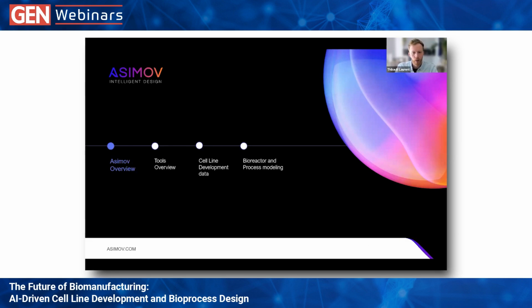As part of this webinar, I will briefly explain our mission at Asimov. We will go through the tools and models we created around genetic designs and how those apply to cell line and process development. Finally, we will touch on the hybrid and machine learning models developed by Asimov to support our processes.